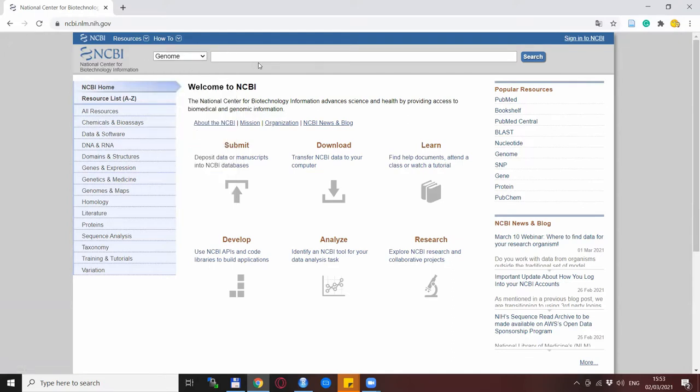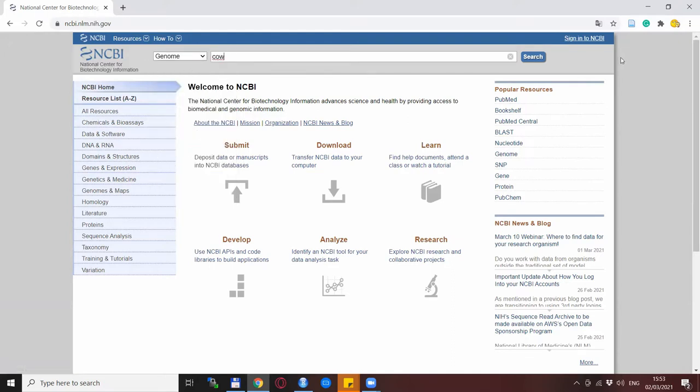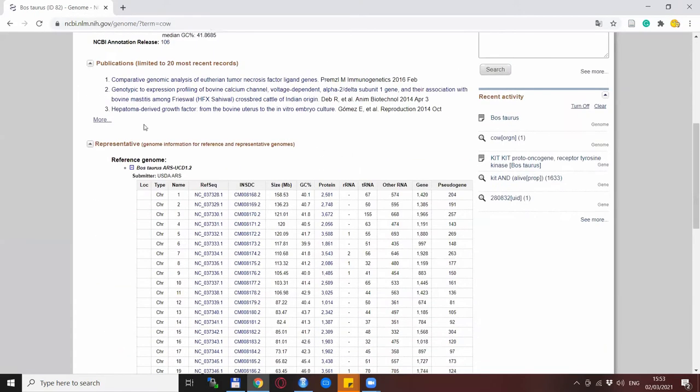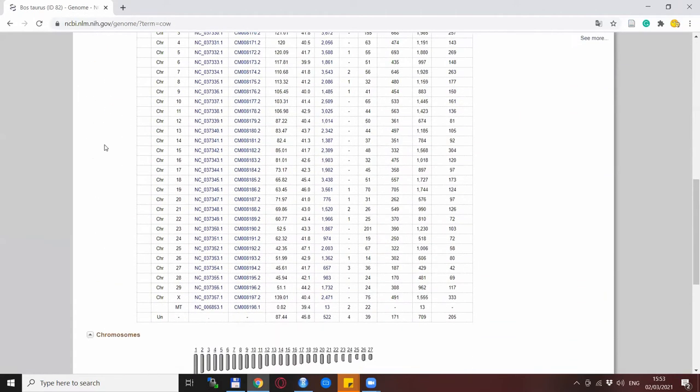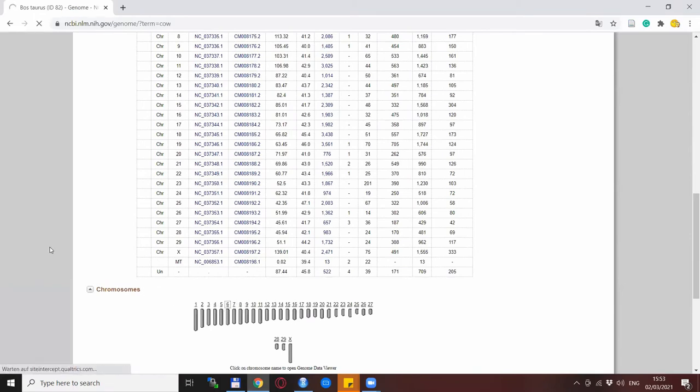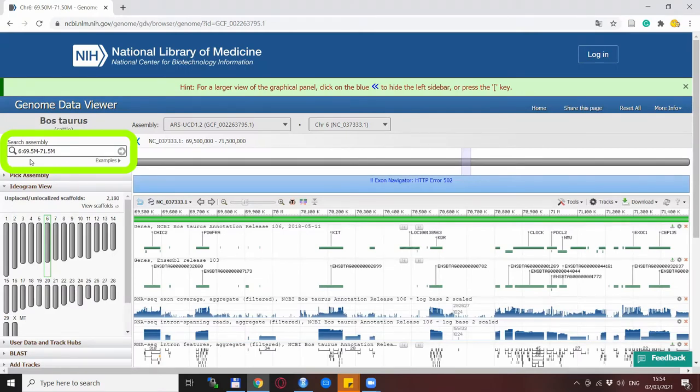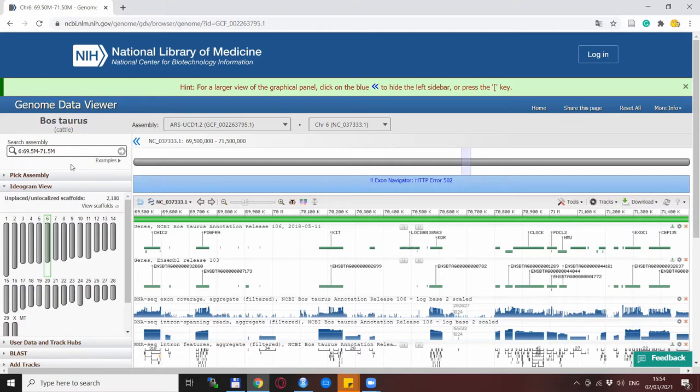What we can do is go to the search bar and search for the cattle genome by typing Bostaurus or just cow. This is the website for the cattle genome and there is a lot of things to explore here. But what we are interested in mainly are the chromosomes. Let's say our thing is at chromosome 6 and our region of interest is somewhere between 69.5 and 71.5 megabase. We can put such numbers into the search bar and hit search and that shows us the part of the region we are interested in.